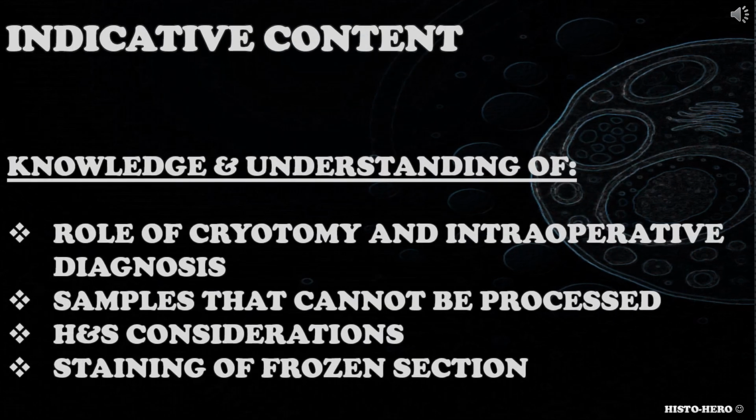Indicative content highlights knowledge and understanding requirements that might be assessed during the viva. They may or may not be demonstrated by the learning outcomes or candidate's evidence. In the cryotomy submodule, the candidate is expected to have knowledge and understanding relevant to the awareness of the main role of cryotomy and intraoperative diagnosis of a range of conditions. Consider nature of lesion, determining malignancy, surgical margins, guiding surgery extent. Relevant to samples that cannot be processed and why.